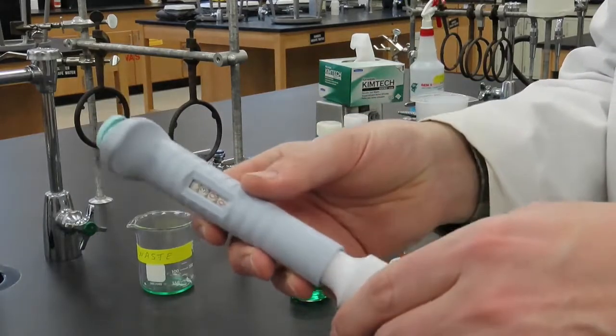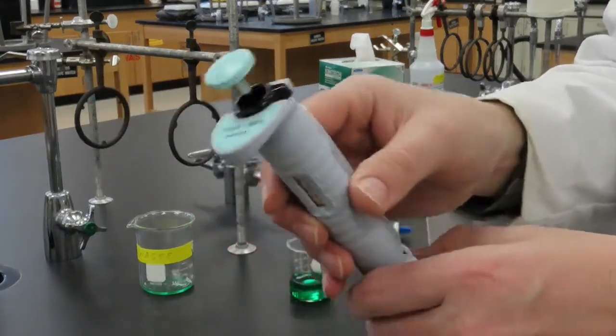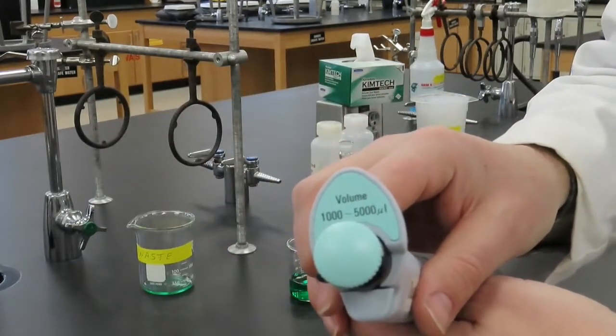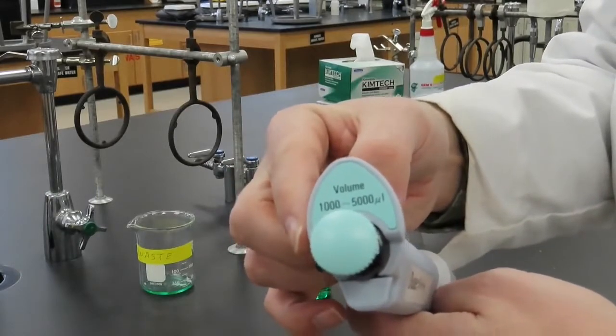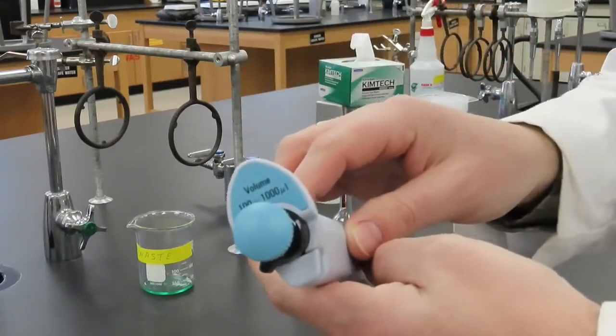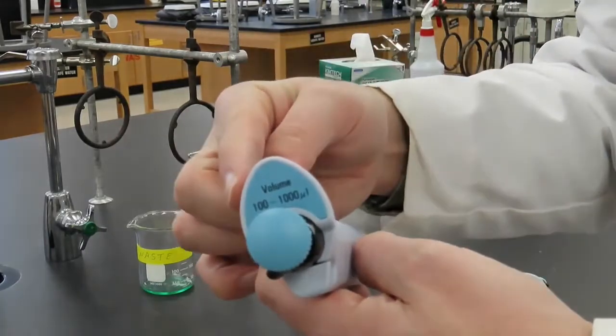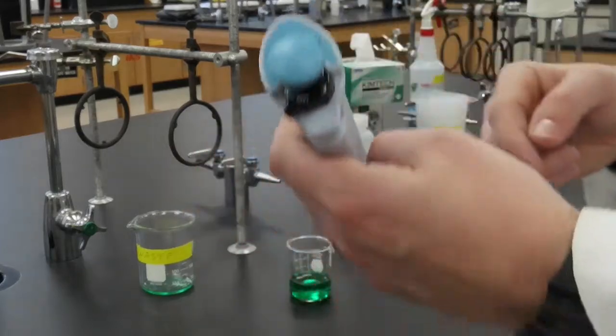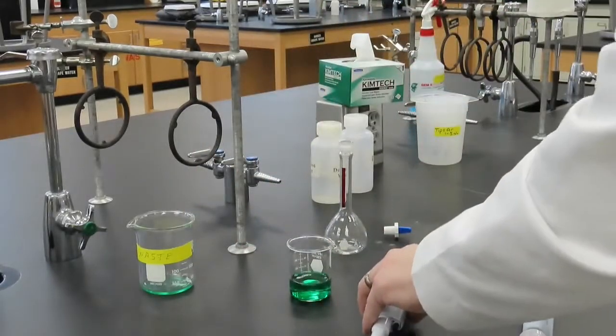Micropipettes come in a variety of sizes, which differ in their volume ranges. We will commonly use two types. The larger pipette has an adjustable volume range from 1,000 to 5,000 microliters. The smaller pipette has an adjustable volume range from 100 to 1,000 microliters. In spite of the difference in size, the two micropipettes operate in exactly the same way.